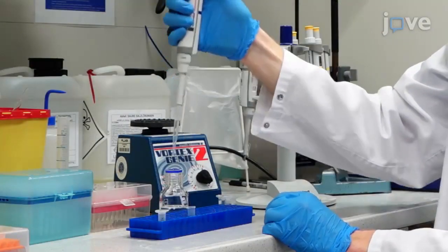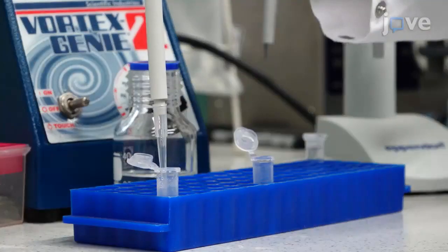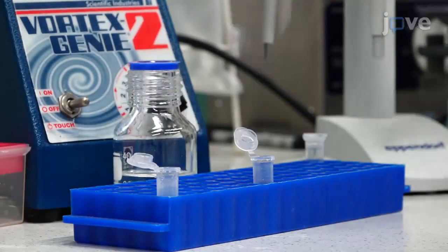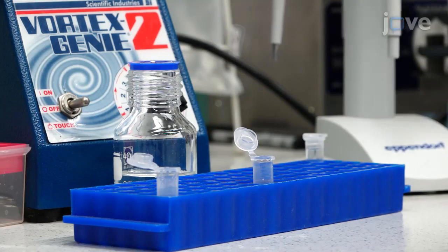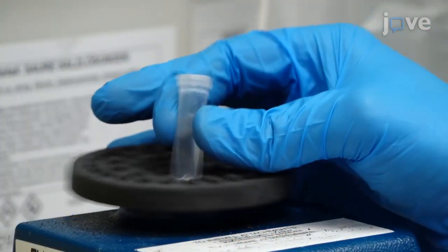Mix 200 microliters of this concentrated solution with 1250 microliters of a 2 to 1 chloroform and methanol mixture. Vortex the solution to mix thoroughly.